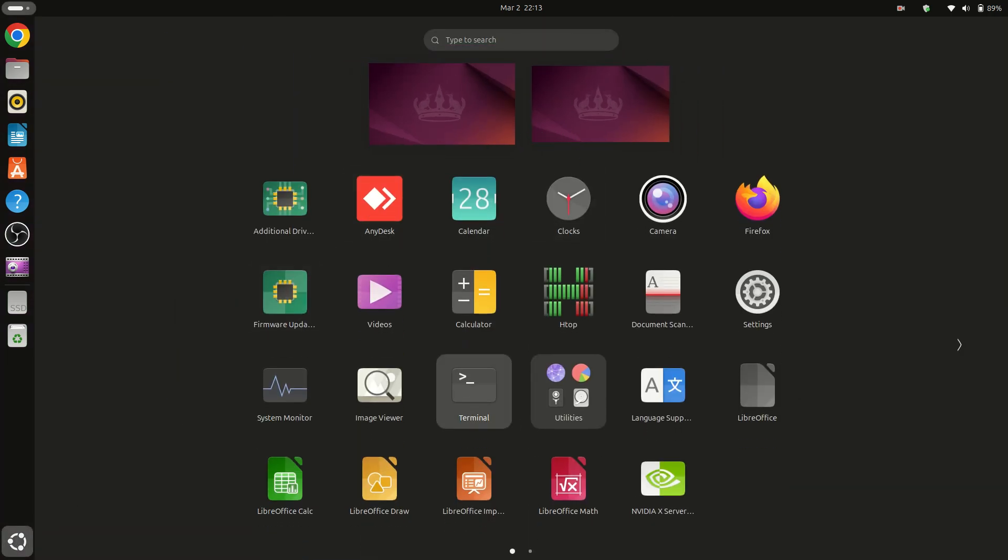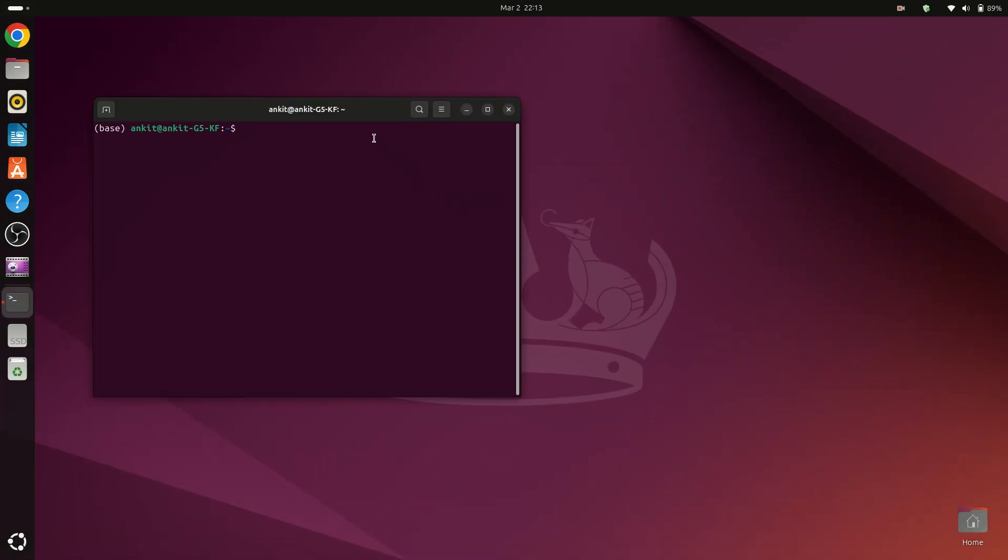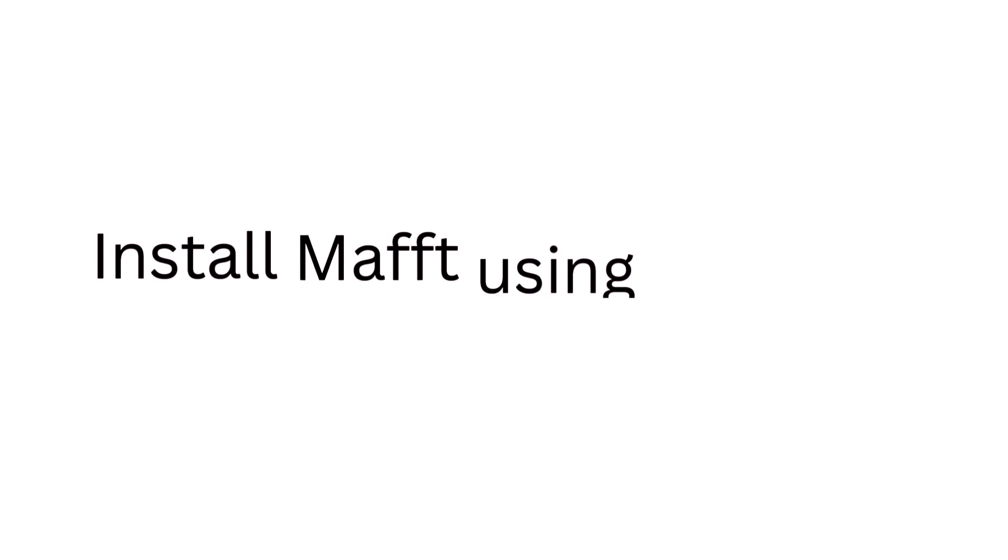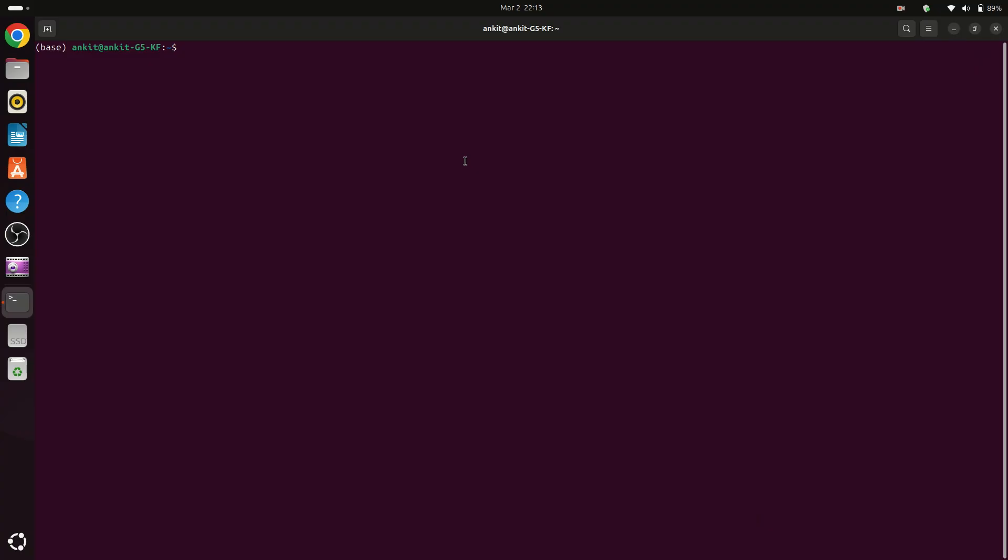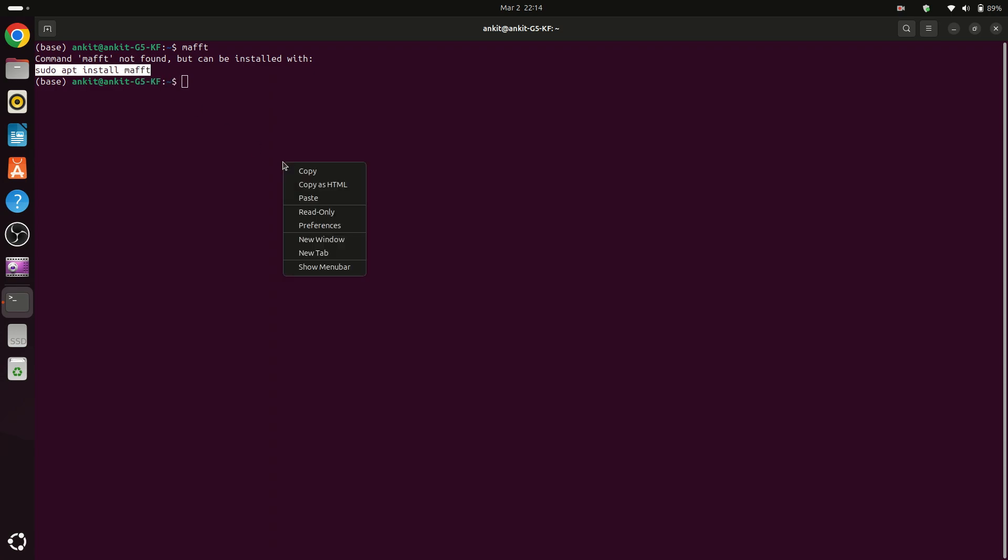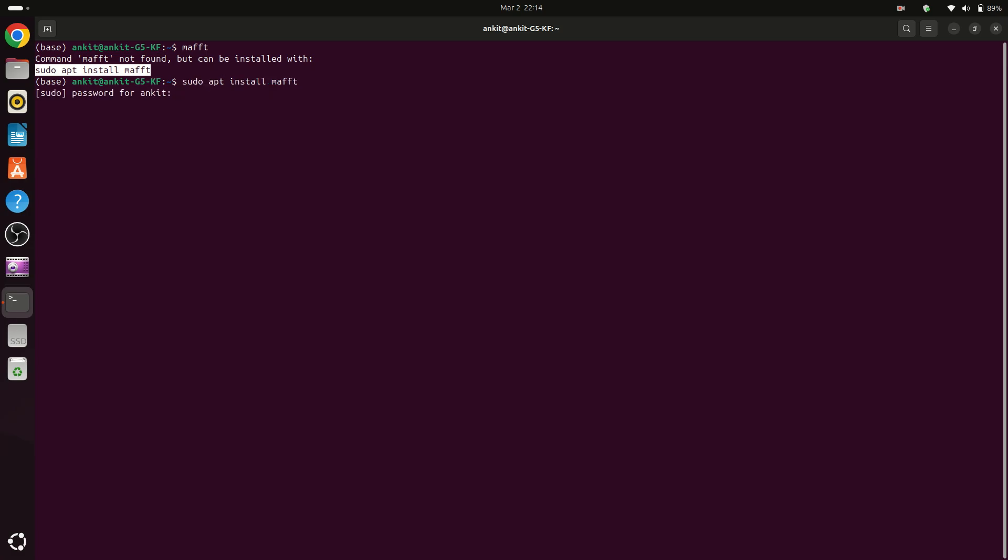In the terminal we can type MAFFT. Remember you need to have an active internet connection. Now you can see that we can install MAFFT from this command. So copy this command and then paste, then press enter.